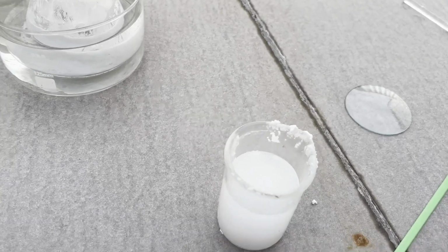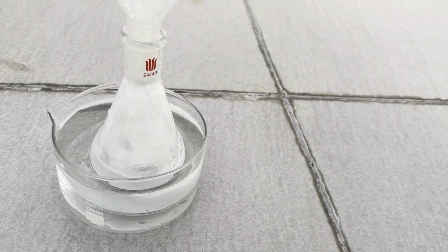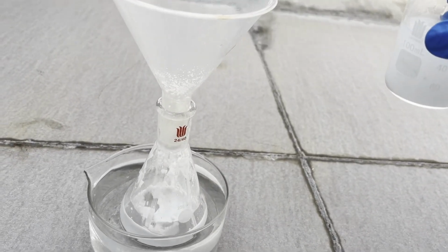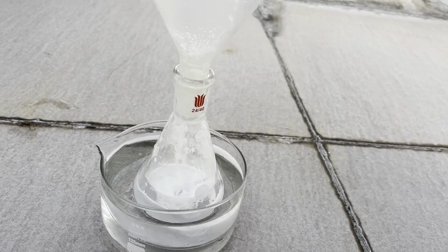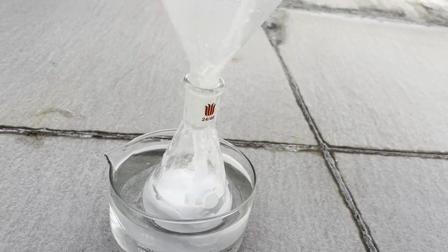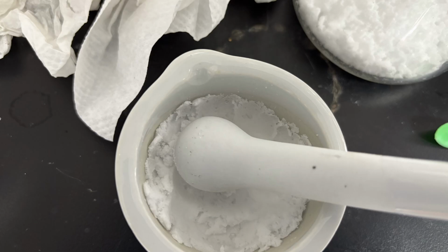Now, some of you may wonder if directly distilling out hydrazine from a mixture of hydrazine sulfate and alkali would work. The answer is yes, but only at a high temperature enough to destroy borosilicate glass. Thus, an alternative approach is taken here. Start by weighing out 67.6 grams of hydrazine sulfate and grind it to a powder. My hydrazine sulfate contains a bit of moisture, so it is not a free-flowing powder, but that's fine.